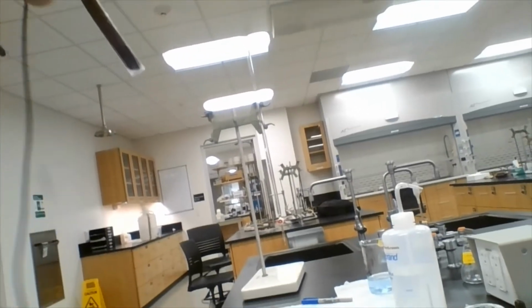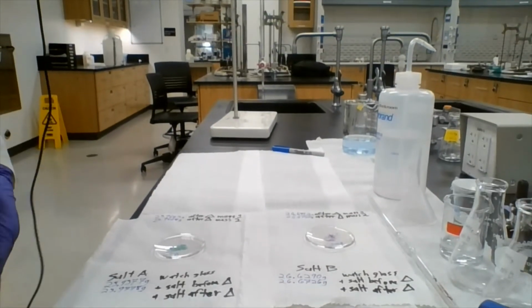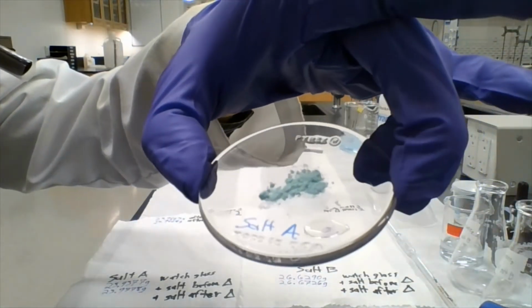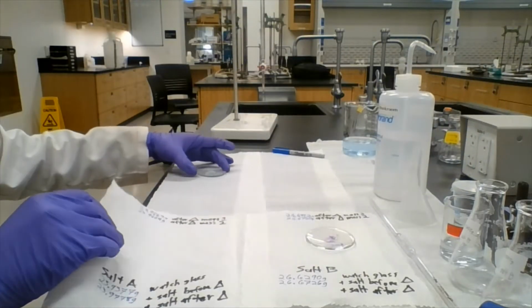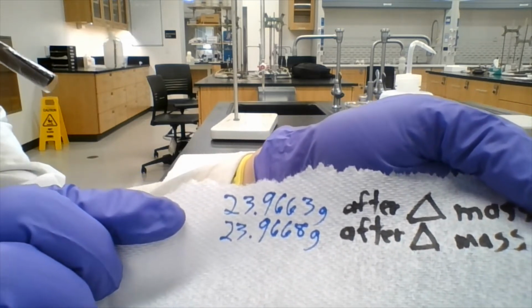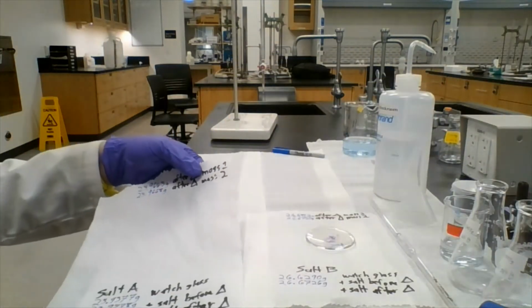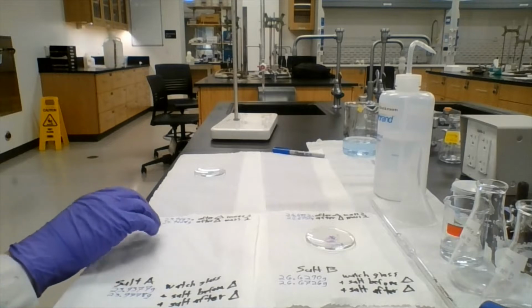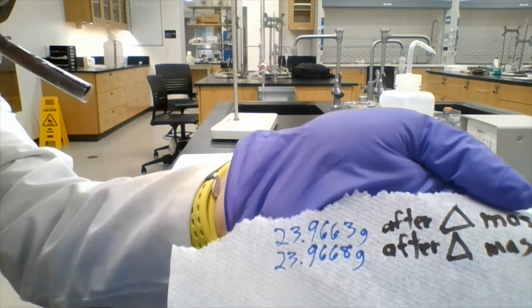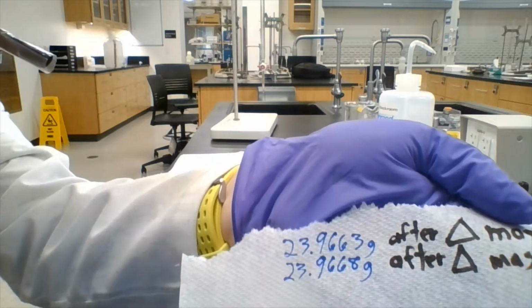And this is the result. I've got salt A right here. And the masses for the two heatings are very close together. Now, what I said before is that if they are within 1% all the way up to 3% of each other, that's fine. But there's a caveat to that 1% to 3%. And that caveat is it's 1 to 3% of the mass of the salt that you added.